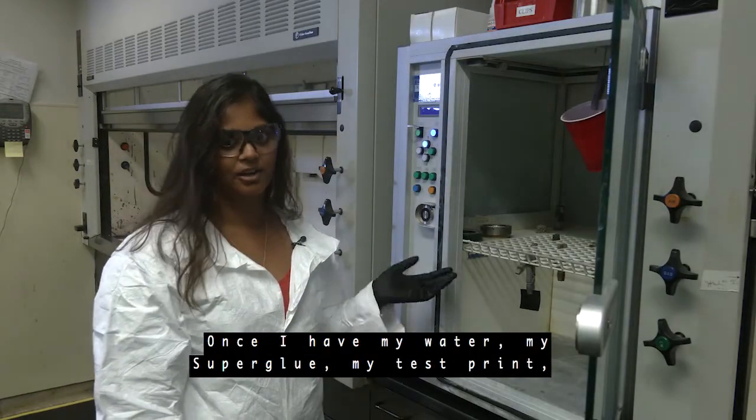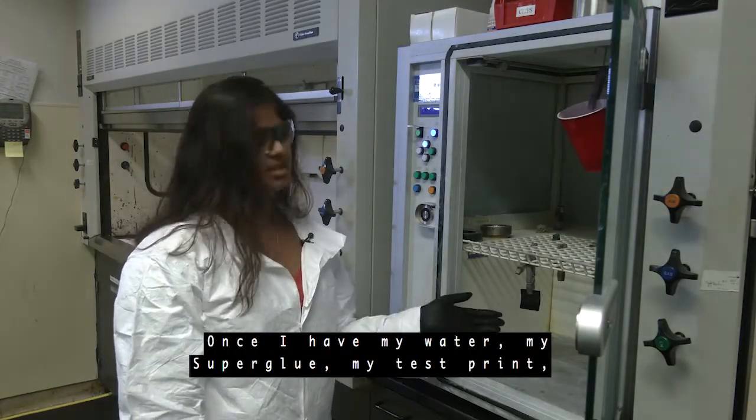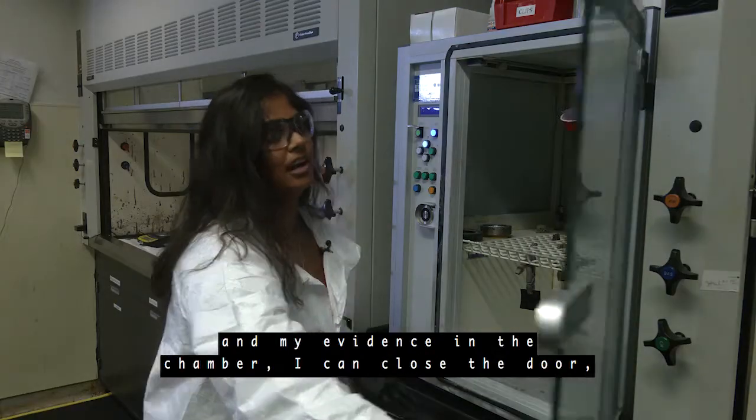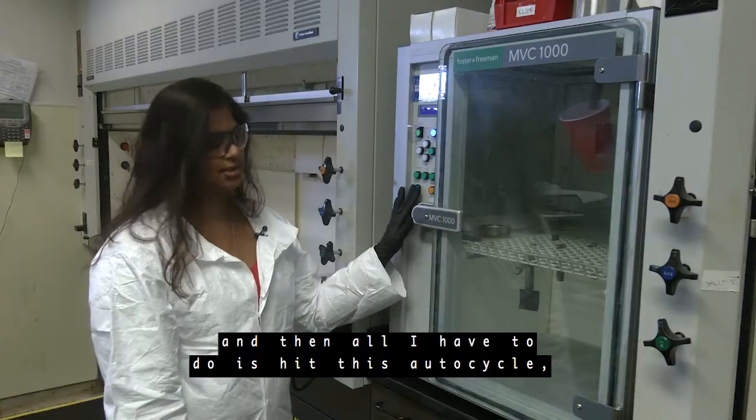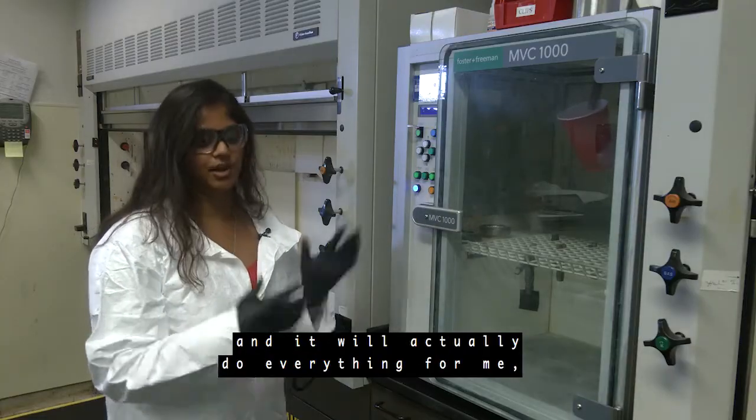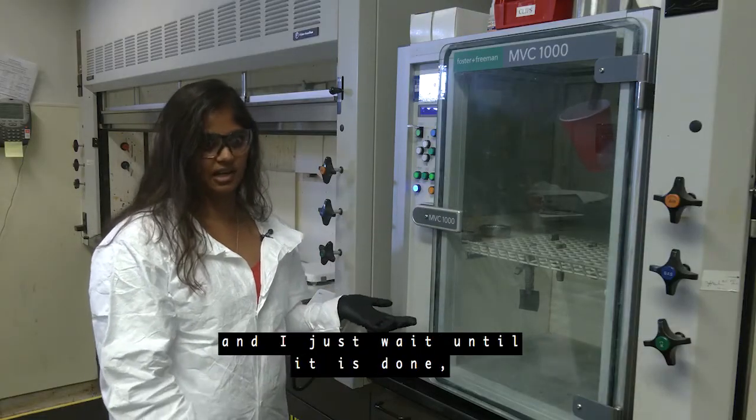Once I have my water, my superglue, my test print, and my evidence in the chamber I can close the door. And then all I have to do is hit this auto cycle and it will actually do everything for me and I just wait until it's done.